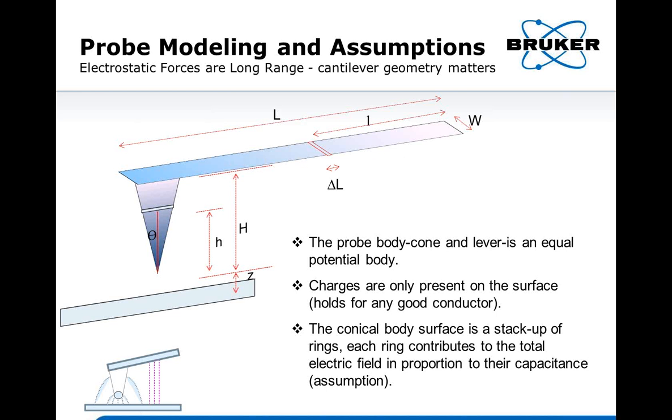So in this model, we have some assumptions. First, we assume the probe body, the tip cone, and the cantilever together form an equal potential body.